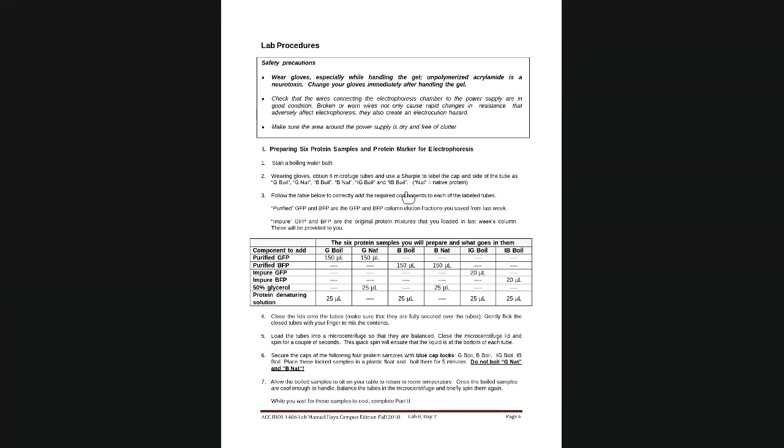Okay, so bottom line is, you've got to read this information so you give me as good a description as possible. It's got to be more detailed than just simply telling me, oh, the NAT stands for native, or the boil stands for it was denatured. You've got to look at this carefully and give me more detail. And I want you to do this so that it will better prepare you for Lab 8 Day 3, where you're going to analyze your gel results. Okay, so keep that in mind for the post-lab.